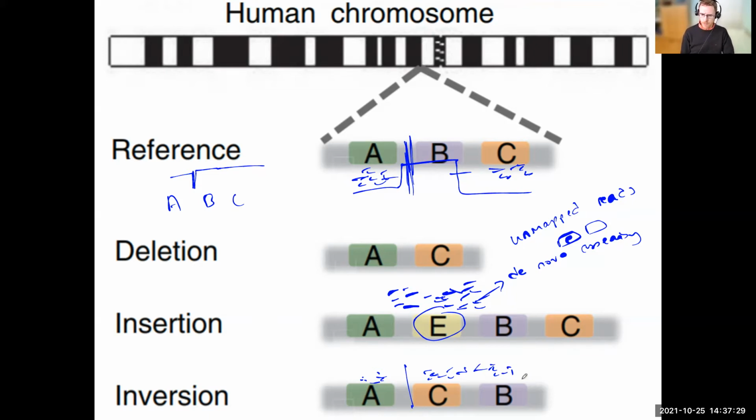And we'd also find that reads that we expect to map from the start of B map to the next region on here, whereas we'd expect them to map into A, and vice versa. Reads at the end of C map into A, like that. So those joins between A and C would indicate that there's actually something present here. So we map those reads, and we'd find that there's actually a big change here. We've good coverage, then a drop, then it picks up, but then there's a drop again. So that change in coverage indicates there's something amiss.